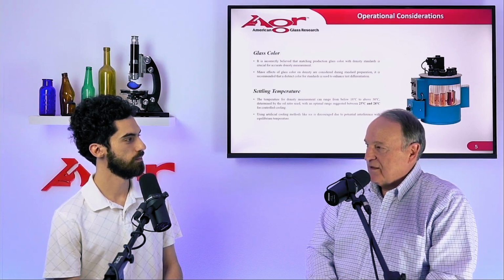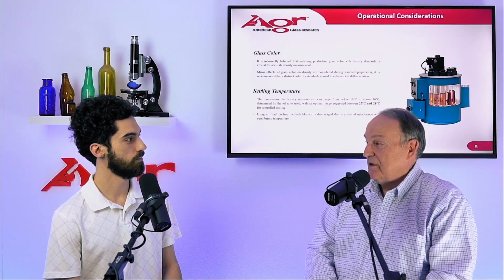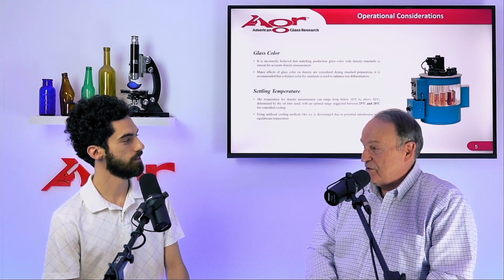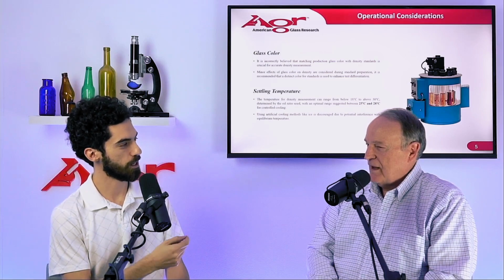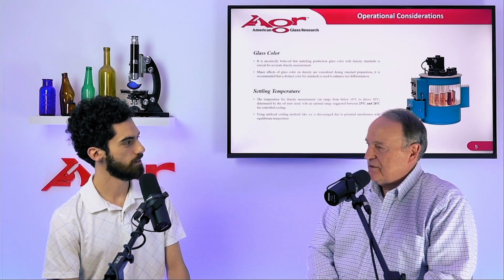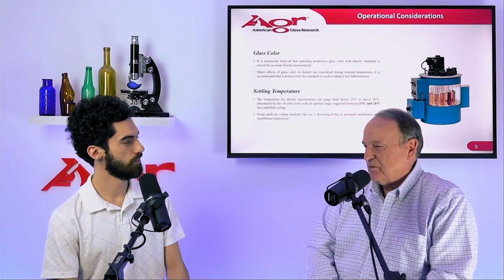You would actually like to have the color of the density standard be totally distinct from the color of the unknown glass so that you can clearly distinguish between the two. Oh, because they're both falling past that reference line. It's not like you can mark them with a marker. You can. However, that introduces some irregularities in the glass surface that could become problematic.